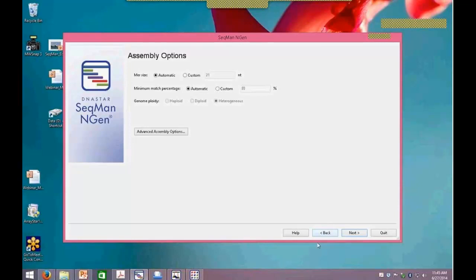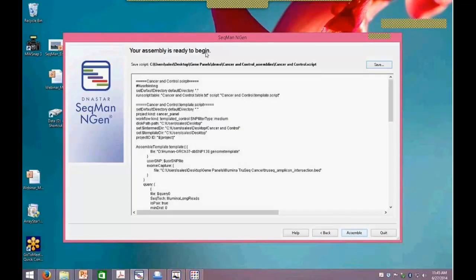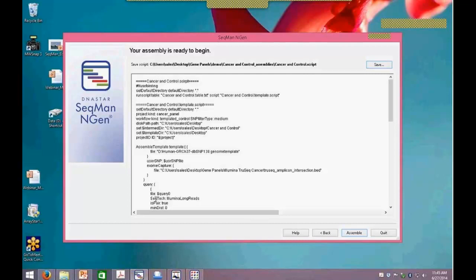After assembly, we'll have two data sets and the option to open in SeqMan Pro to look at tumor or normal data separately, or to launch ArrayStar. With this kind of workflow, going to ArrayStar to compare the two sets to each other is probably the best option. There's a button that just says 'open in ArrayStar.' ArrayStar will look something like this when you open it — we'll have a control or a tumor. We can also bring in additional experiments or save project files and load them into ArrayStar at a later time.